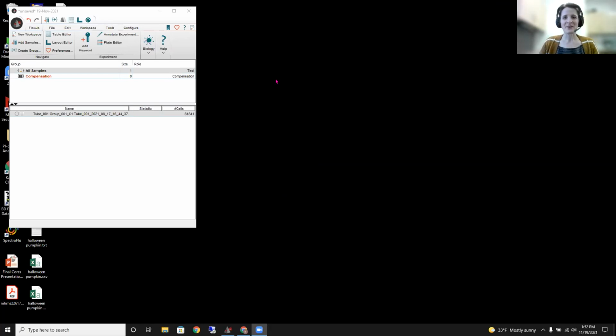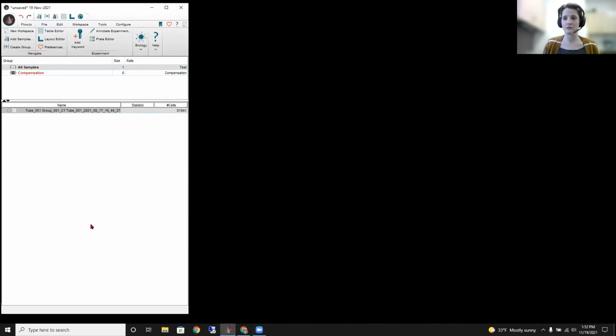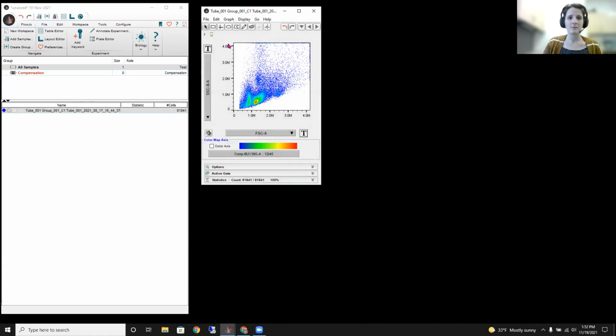Okay, so talking about viability dyes is something that I think myself and many other cytometrists are pretty passionate about for the reasons that Derek mentioned. So what I'm going to do is walk you through a file and an analysis of an immunophenotyping panel from Toby Oni here at the Whitehead Institute, who we're very thankful allowed us to use his data file. So if we open this up, this is from a Cytek Aurora.